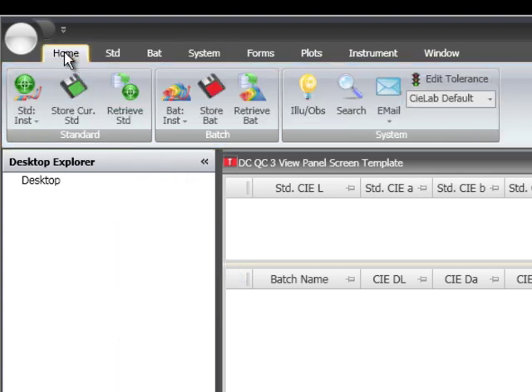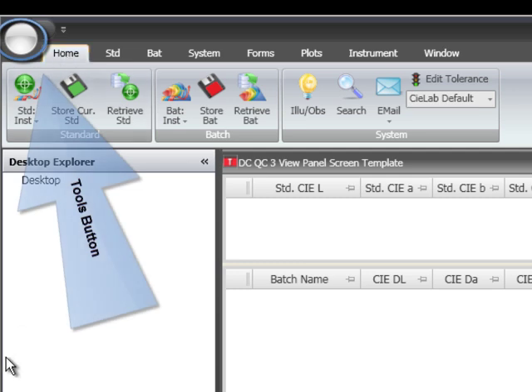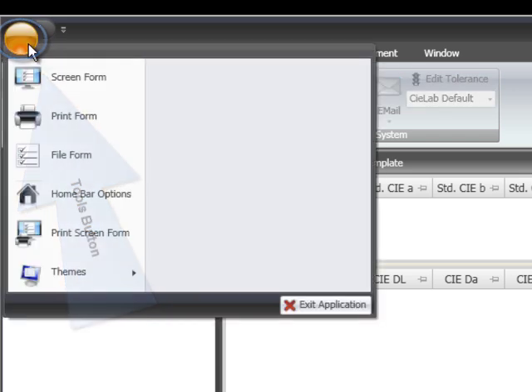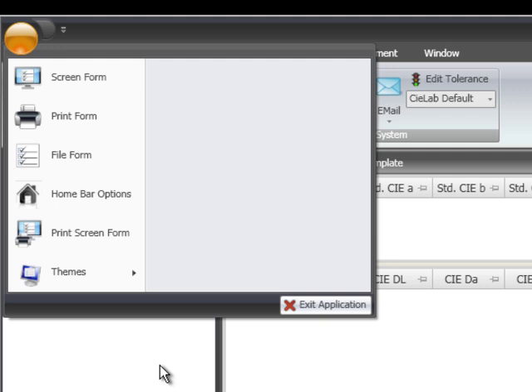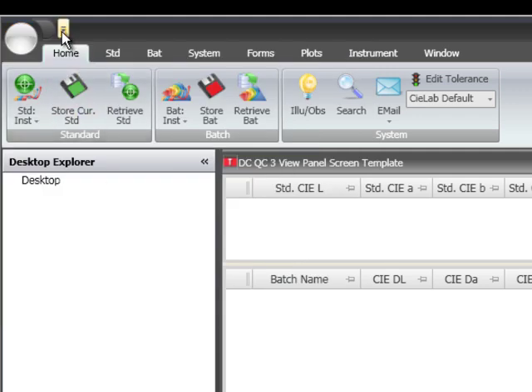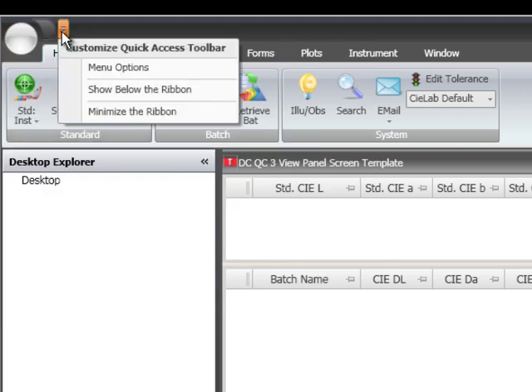The large round button to the left of the home tab is known as the tools button and is used for opening and printing forms and templates, as well as quick access to those items that have been opened during a session. Configuration options for the home bar and exiting the program are also located here. Next to the tools button, there is a small down arrow that allows you to customize the quick access toolbar and ribbon bar management.